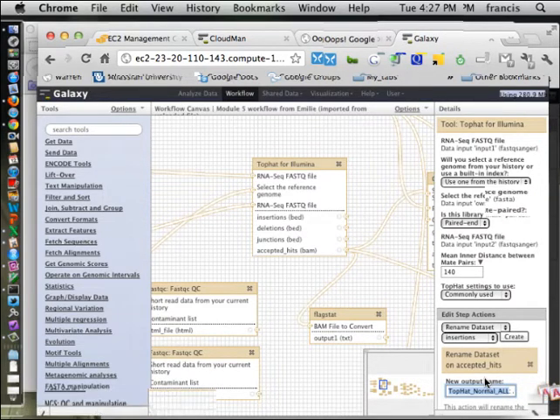Yeah, I think the best way of doing that would have been not what I've done here, but doing, for example, three different workflows. One workflow for aligning, or maybe, for example, Cufflinks, that you can repeat several times on the different samples. Then one workflow with Cuffdiff to compare two results of this previous workflow. And then the last workflow for doing post-processing. In this case, I put everything together for you to download it. But that would be a better way, because then you would be able to reuse the workflow blocks on different data sets.